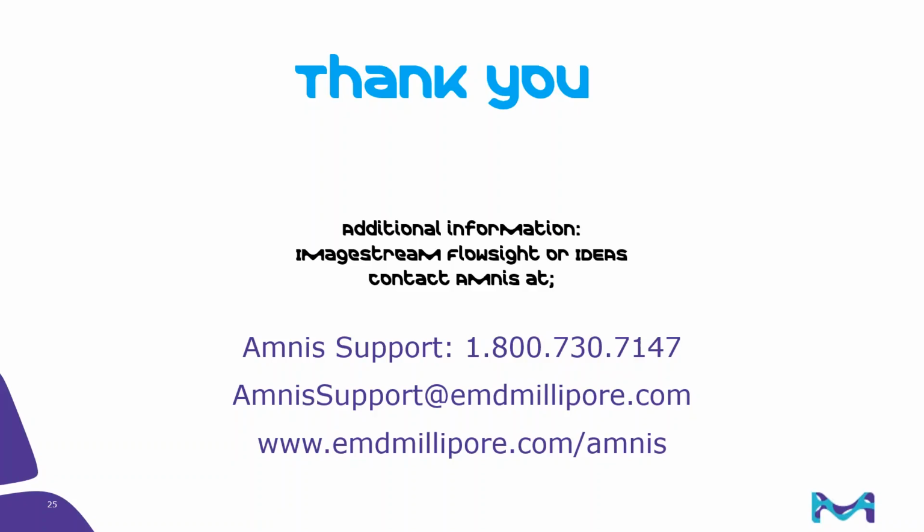And I think with that, what I'll do is turn it over to Sean, who will give you a detailed demonstration of how FCS Express with the image analysis works on IDEAS data sets. And so, Sean? Hi, Brian.